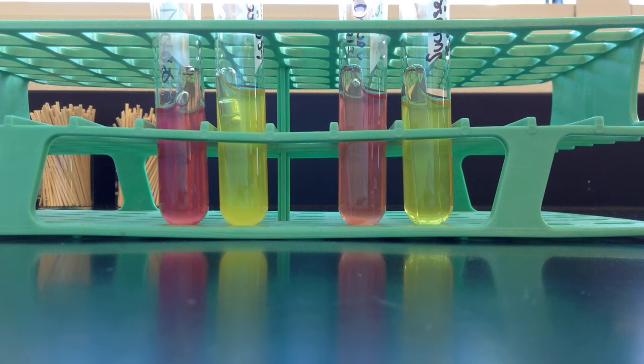One nice thing to do with these is to use them in conjunction with a TSI tube, in particular a TSI slant, because TSI has multiple sugars in there, so this can help narrow down or give us additional supporting information as to which sugars are fermented. And that is the carbohydrate fermentation with Durham tube.